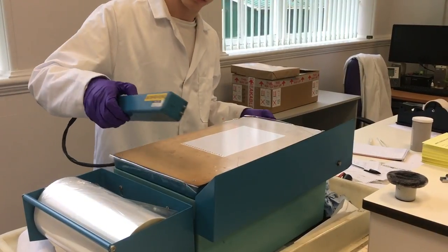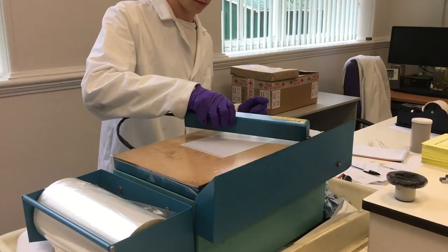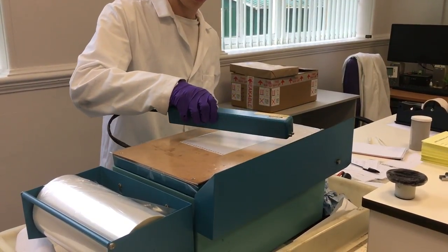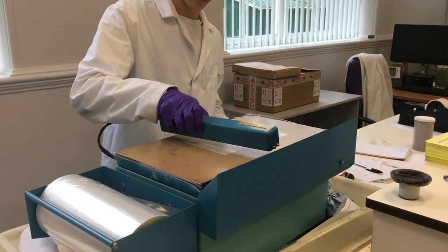An electrostatic charge is passed across the film. The charge allows the film to present the indentations in the paper. The wire giving off the electrostatic charge is inside a box that Aaron is holding, and that box is called a corona.